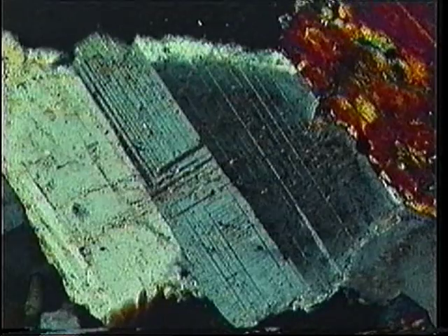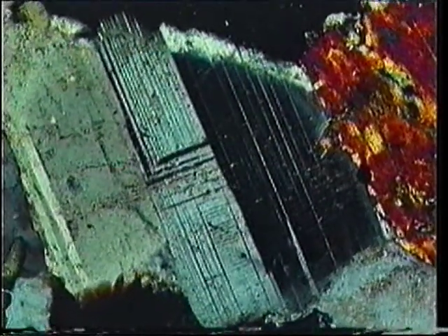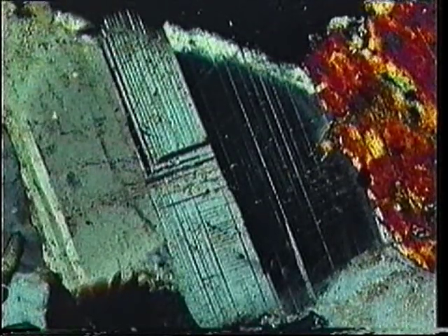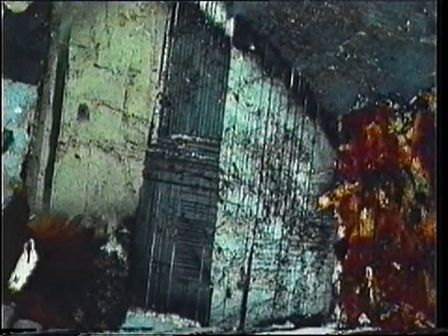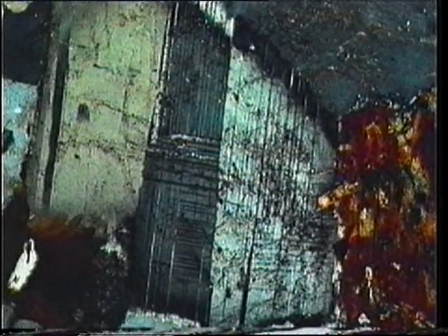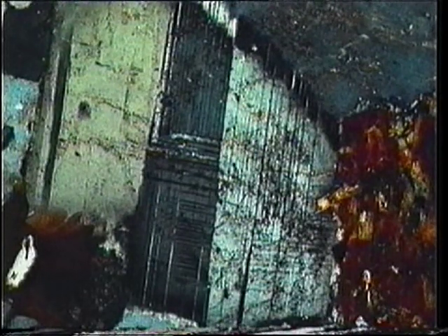A sharp break in composition can occur between the core and the rim, as here. The core has a positive extinction angle and the rim a negative extinction angle. Repeating that stage rotation, the more calcic plagioclase in the core has a higher positive extinction angle, the more sodic plagioclase in the rim has a lower negative angle.